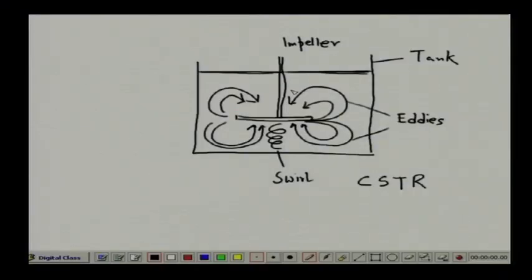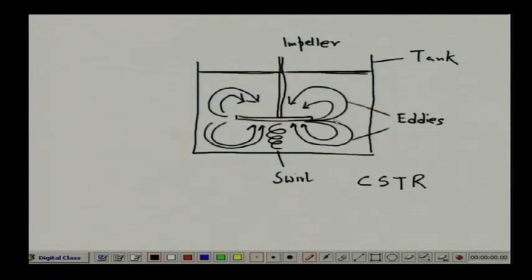This is the basic principle of the bioreactor, because the cells which will grow inside the reactor depend on the oxygen concentration. It does not end here, because this dissolved oxygen concentration is a very vital parameter in any bioreactor, because of the cell growth. If I continuously measure this dissolved oxygen concentration, we will find that in the initial stage there will be a good consumption of the dissolved oxygen. So the dissolved oxygen concentration will slowly fall, because more and more cells are growing.